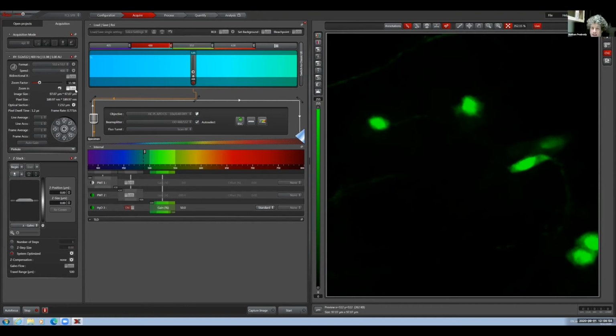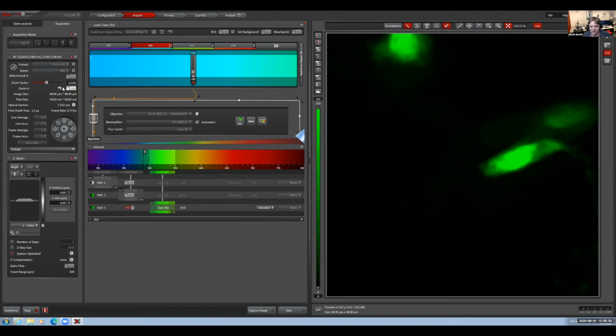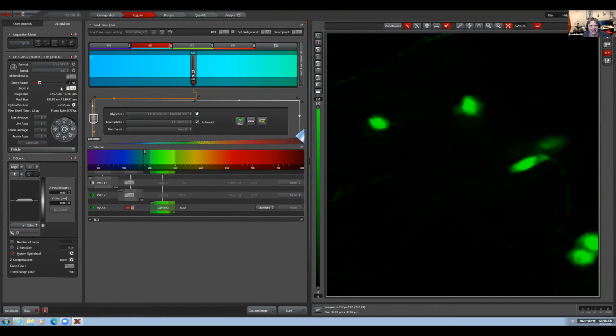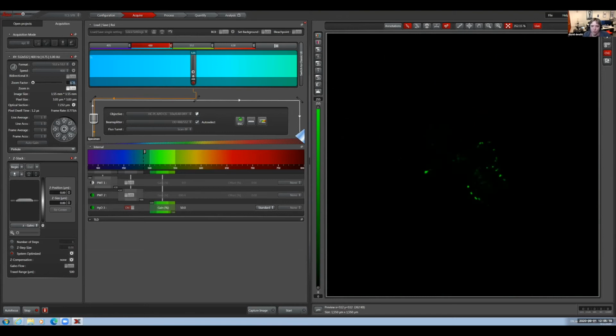Oh, you mean you can do it again? Yep, once you've zoomed in there, you could actually click it back on and zoom in further on one of those sort of pairs of neurons or something. Oh, but the reset only remembers the last one. Correct. But you do have that whole zoom factor slider where you can just slide it to the left to move all the way out. Gotcha. Or spin the dial on the thing in front of you.